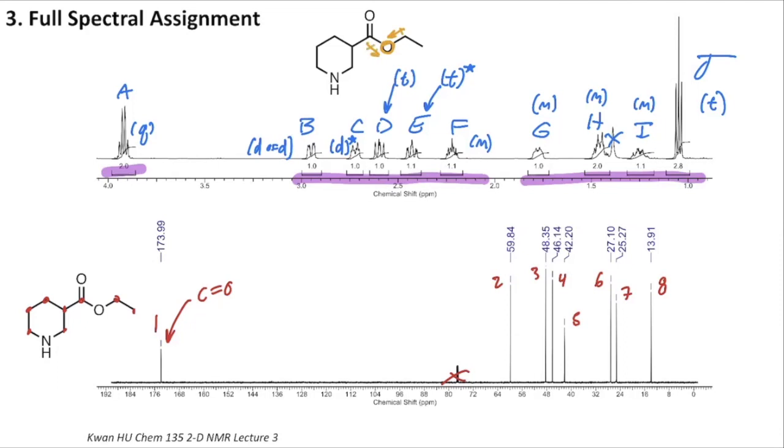We also have the carbonyl to be thinking about. Normally, we think about that as really centering a lot of positive charge here at the carbonyl carbon, which is why we see the carbonyl carbon at the highest chemical shift in our carbon NMR. But it also means that the partial positive charge on this orange colored in carbon is also going to be withdrawing from the carbons next to it. So we could draw another small dipole moment that's pointing in toward that carbonyl away from our ring. So those are a few things to think about.